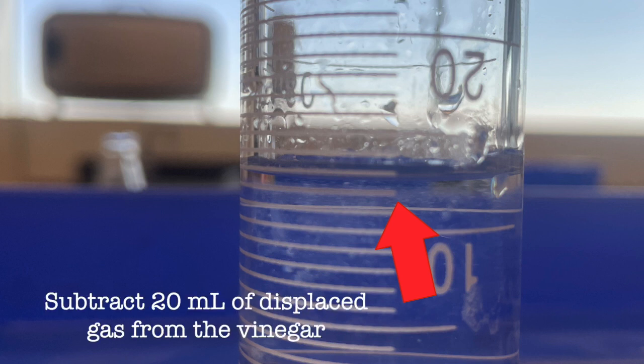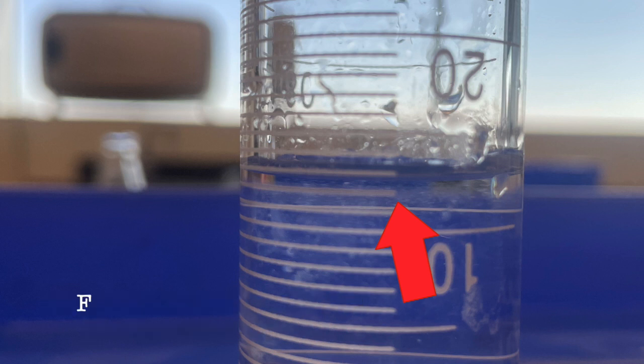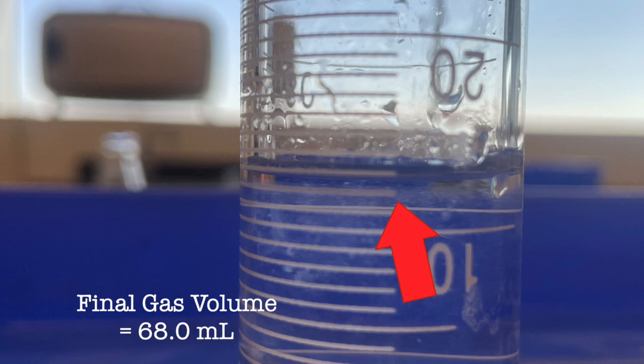Now remember we added 20 milliliters of vinegar, and so that volume needs to be subtracted because that amount was displaced originally. The final gas volume then is 68.0 milliliters.